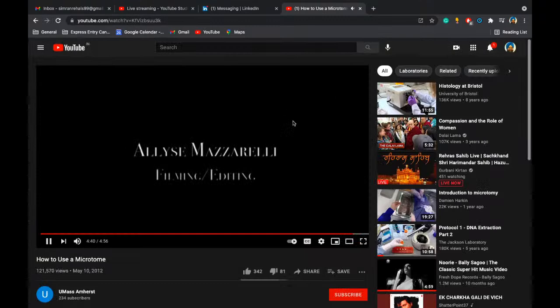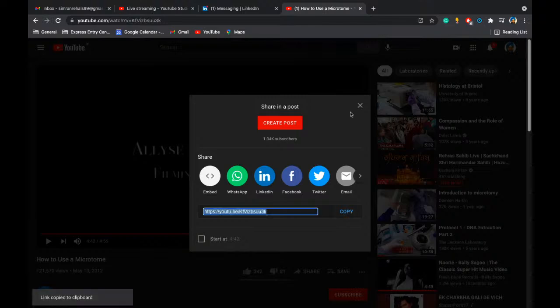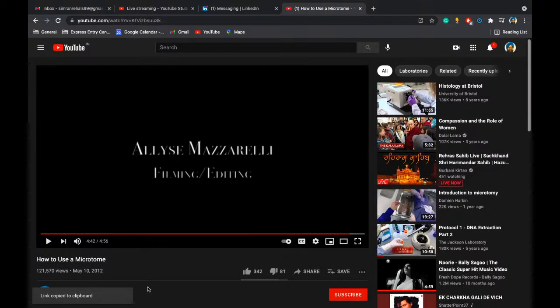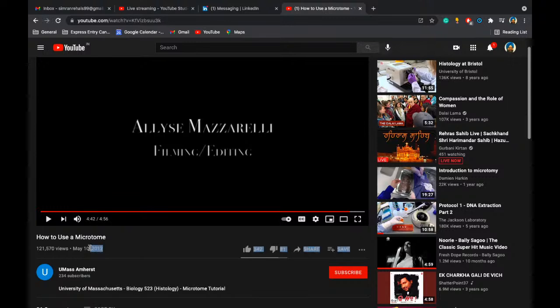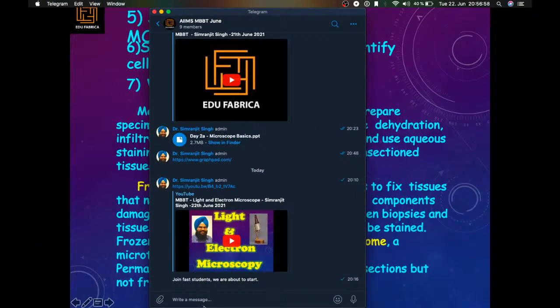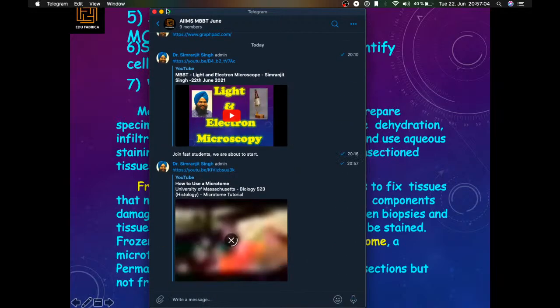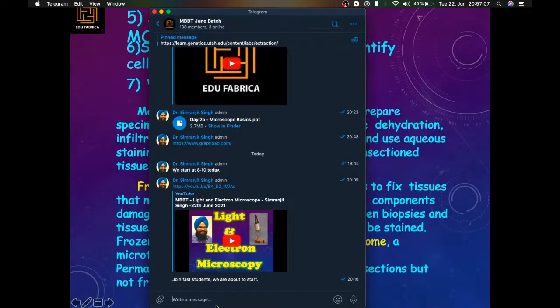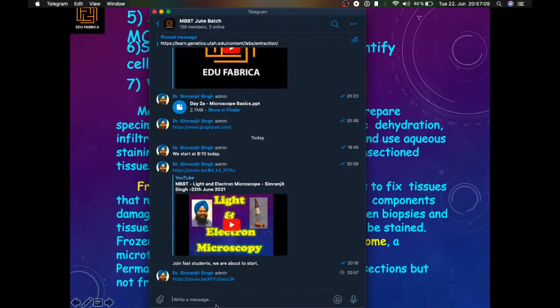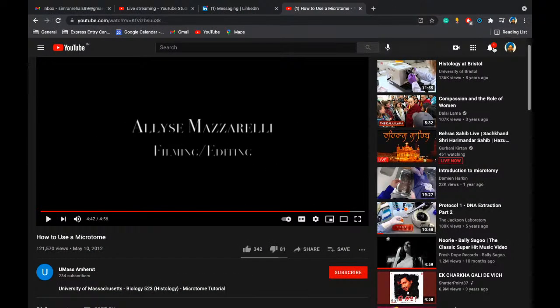So that's very specific, very simple, but they are showing a very old style of microtome actually. Yeah, in 2012 I used them. Actually I used them in 2012 also, but in my case it was more advanced. Water was going through automatically. I did not have to put water on the slide. Yeah, I was at Max Planck also at that time. That's how you make your sections.